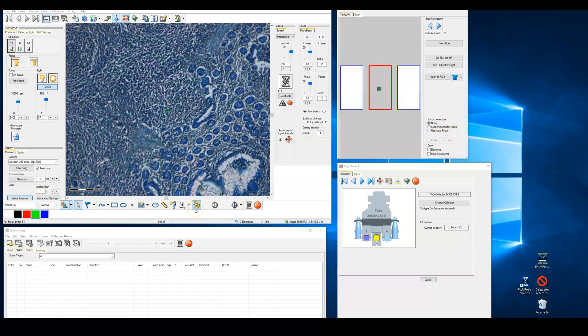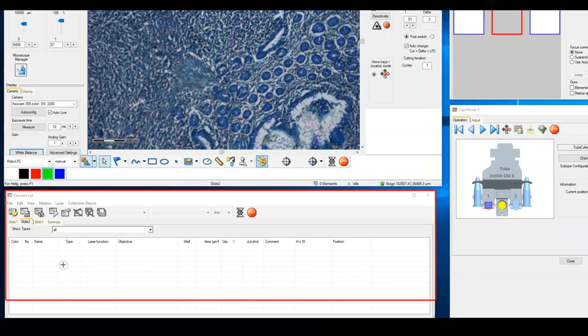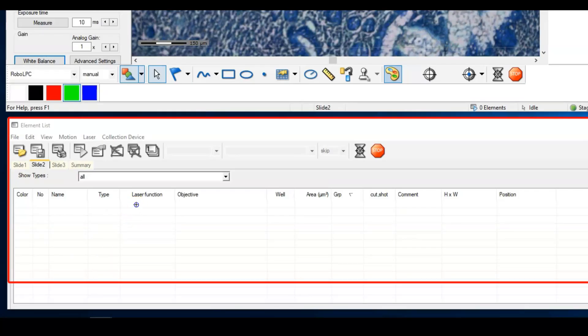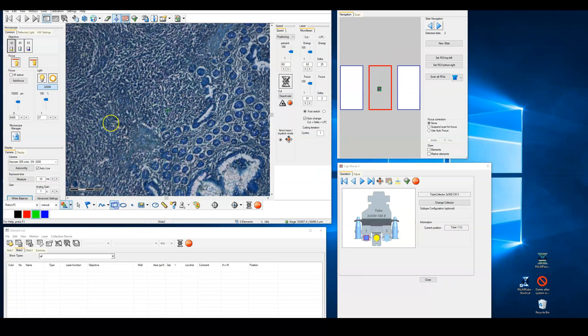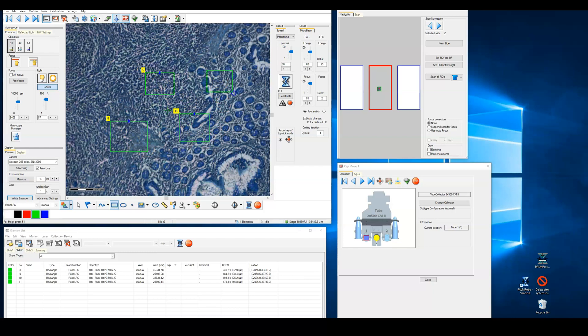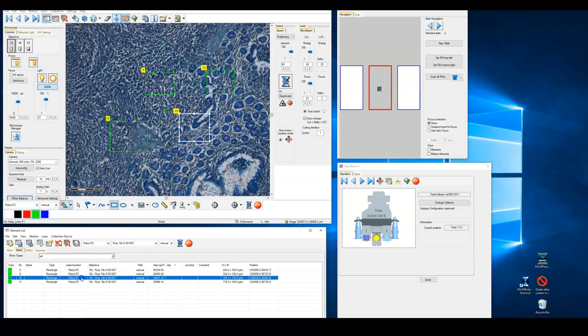Moving on to the elements window, below the main window here, you can see all of the details of the elements we've drawn. An element is the terminology that RoboSoftware uses for a region of interest that is to be cut and catapulted. Note that the elements are displayed in the individual lists for each slide. Note that once the element is drawn, clicking on the cut button will process all the elements by default, not only the element that is selected.